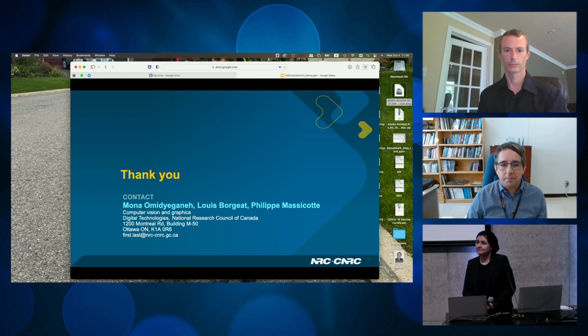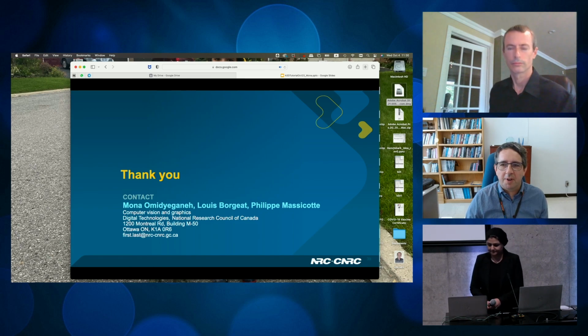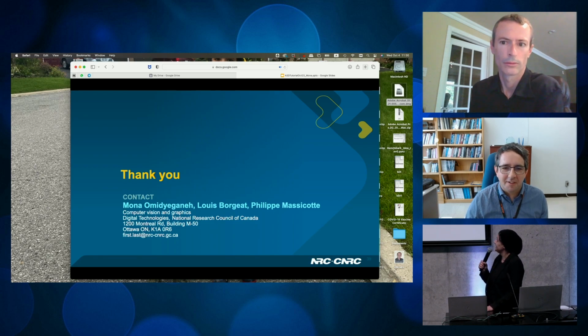Why is the software not open source? It's open source. Can I download the source? Louis, I think you can answer this. We cannot hear the question. Okay. He's asking if A3D is open source.